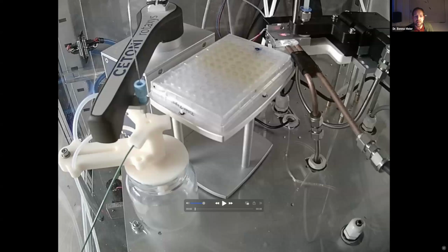So you can see this here. You have this pipetting arm. And here you have this moving arm. So first, this moving arm will now place a bullet into this receptacle, this aluminum block here. And then it will get filled.